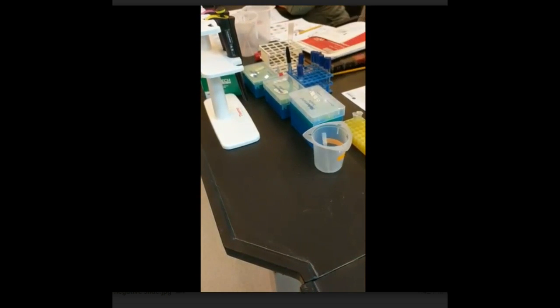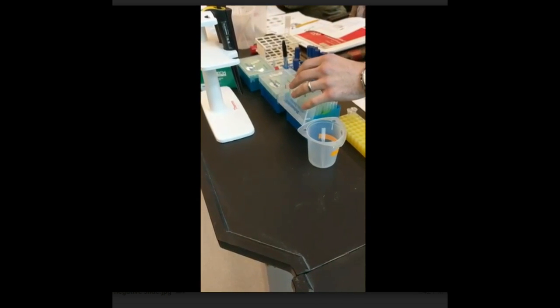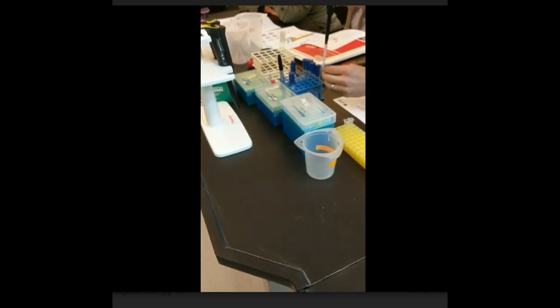Remove 100 microliters from tube 3 and place it in tube 4. Mix gently, change the tip. You're going to keep doing this with 100 microliters until you get to tube 6. Prepare tube 7, which is a sample without phage, by adding only 1 milliliter of tryptone broth and no phage.